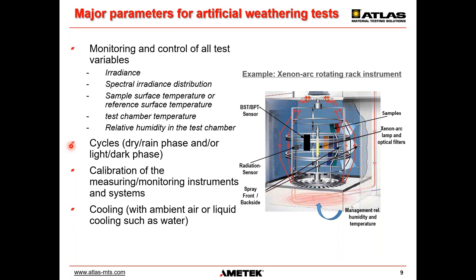Calibration of the measuring sensors, of course, is also key. Otherwise, you have no track of the precision of your instrument. Typical calibration routines are every 6 months. A special accessory for some weathering testers are chillers, air chillers.